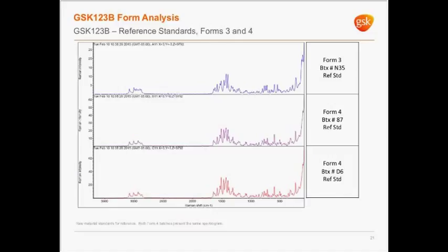And so the data you're actually seeing is sometime beyond the 1 hour time point. I call it 1 hour data, but it's a little bit past that for the amount of time it takes to prep the sample. So we hope to eliminate this issue with a new 96 well plate XRPD, which we've recently purchased, and it's intended to analyze samples nearly immediately after the solubility samples are extracted.